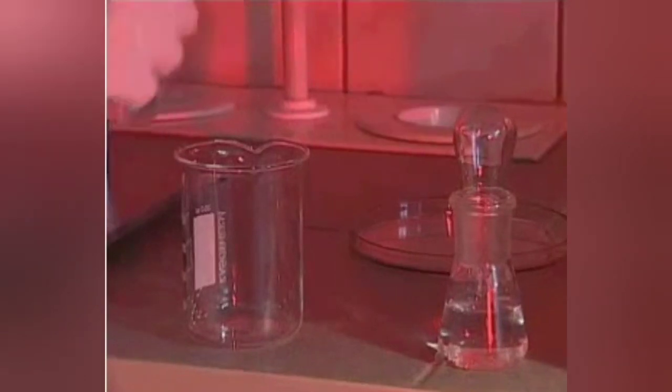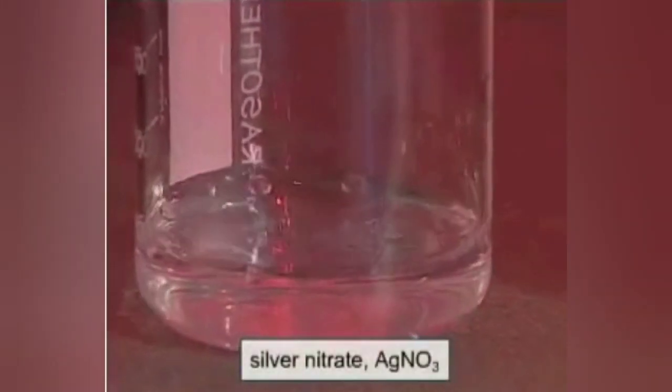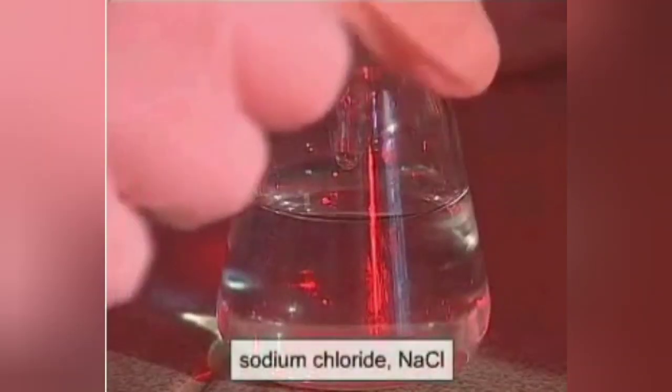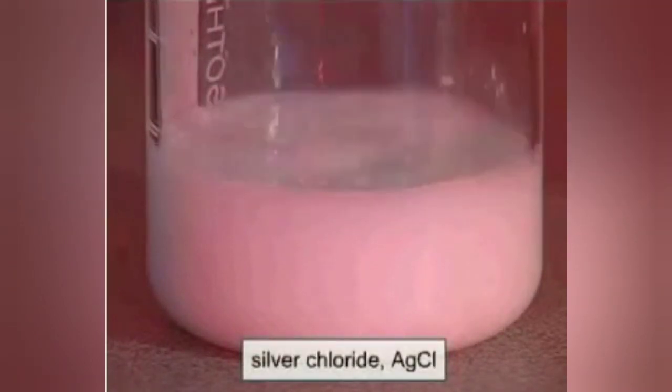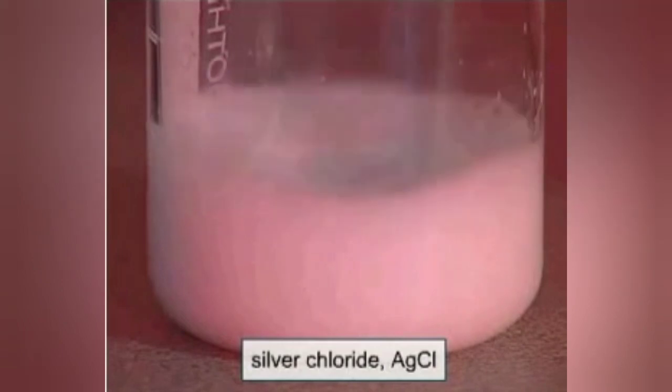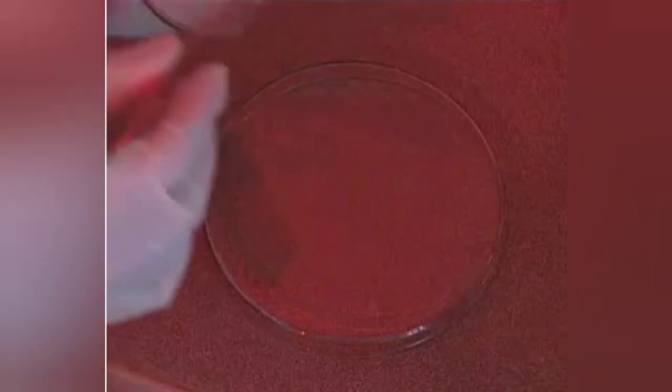Let's carry out a chemical reaction that occurs under the influence of light. We mix dilute solutions of silver nitrate and sodium chloride. An insoluble precipitate of silver chloride forms. We filter the mixture using a filter paper and funnel. We wash the precipitate with distilled water. Then take the filter paper out of the funnel and spread the precipitate out over it.